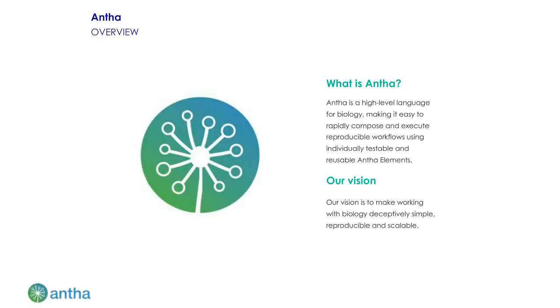So, recognizing that we needed to be able to start to move up this ladder, to have a tool stack that allows us to engage with the complexities of working with biology, at Synthace we created Antha, which is very much like VHDL and Verilog, a language for describing what you are physically trying to produce. What is the experiment that you're trying to conduct?